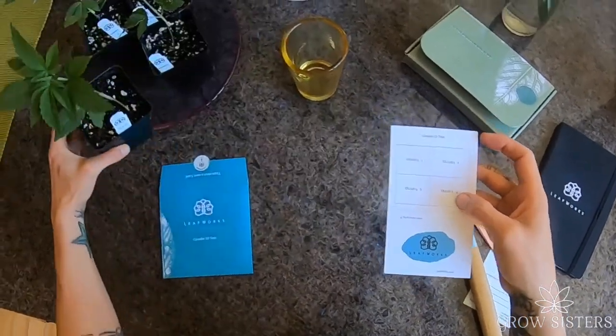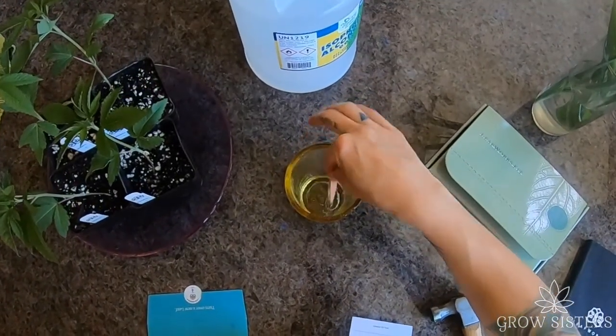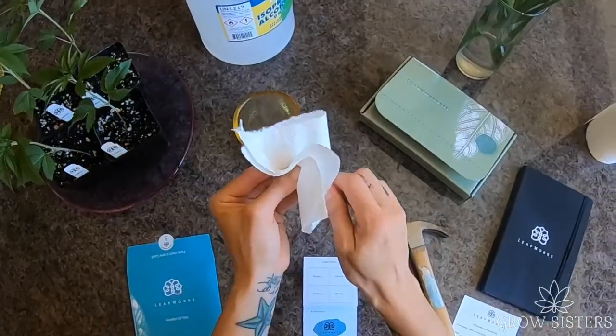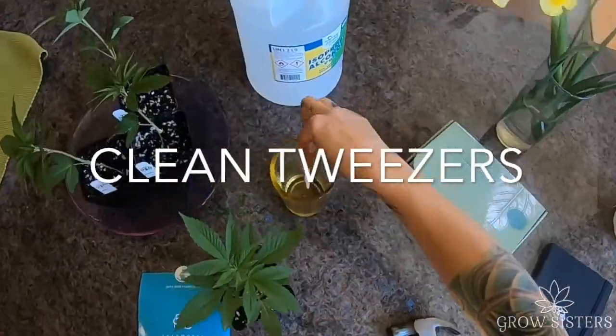You will repeat these steps for your next three plants. But wait — before moving on to your next plant, dip the tweezers into the cup of alcohol for three to five seconds. Wipe dry with a fresh paper towel, and be sure to not let the samples spread from their designated collection spots. Then repeat for each remaining plant.